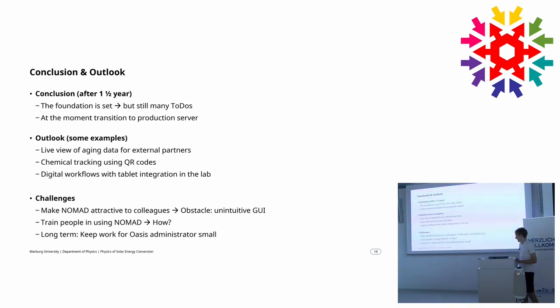The biggest challenge is, I would say, making NOMAD attractive to colleagues, and this is why it's good that we're all here today and talk about stuff. Because the GUI is, of course, often a little bit of an obstacle at the beginning. I now, after 1.5 years, find my way through NOMAD very easily and can jump through all the schemas. But for people seeing it the first time, it's always like, what's going on?